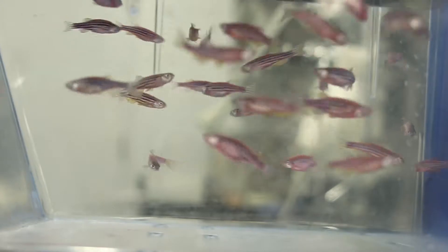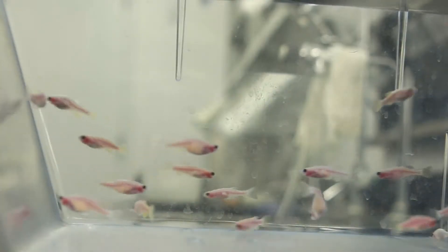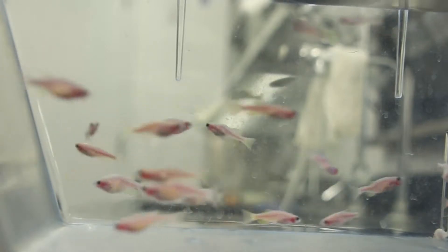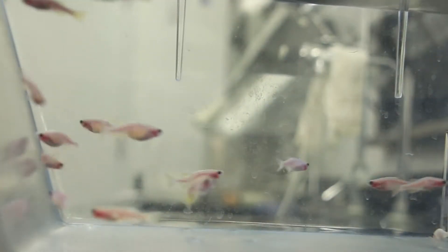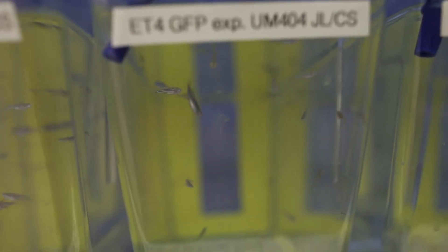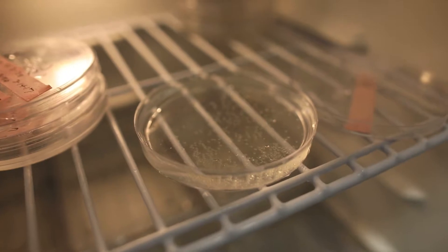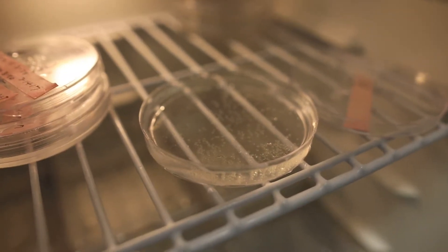2,500 to 3,000 adult fish is the total for our colony. This allows us to keep many genetically distinct lines of fish while tracking only a few independent water quality measurements. All the adult fish you see here were raised from babies so as to avoid introducing pathogens.